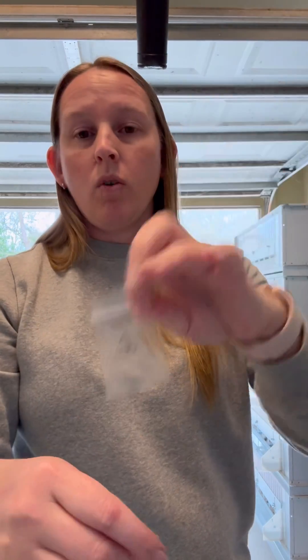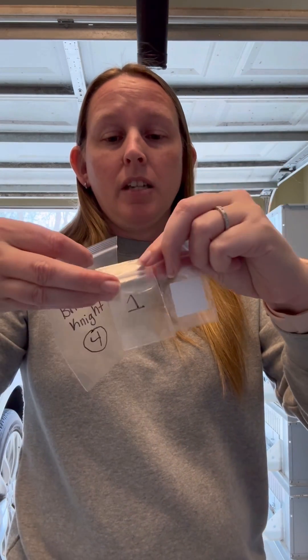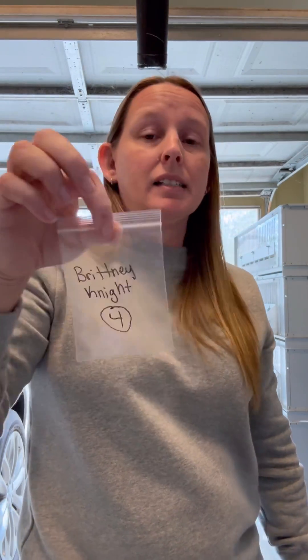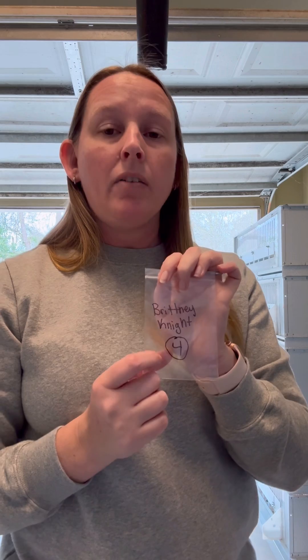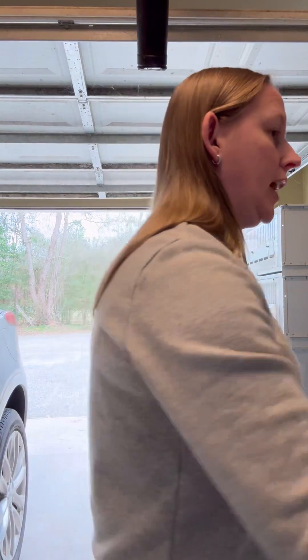Some people just label the baggies one through however many chicks they're doing; some people put a little sticker on there and write on that. Either way is fine — you can write directly on the bag or on a sticker, as long as it's legible. Then you're going to need a larger bag to put all of your individual samples in. If you're doing four samples, you'll want four little bags for your PCR tubes, then put all four bags into a larger bag — a sandwich bag works fine. Label that larger bag with your name and however many samples you're sending in.